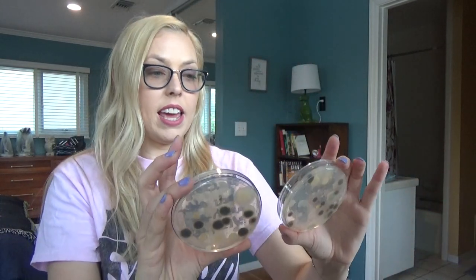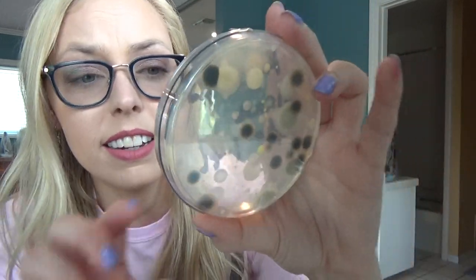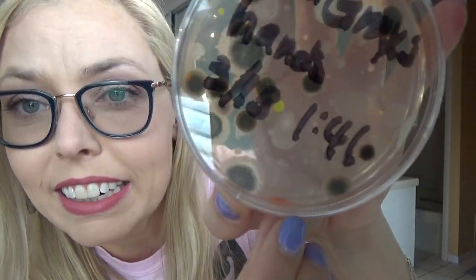Let's look at my hands before and after sanitizer — I don't even know what to make of this. Here's before sanitizer. Not that surprising — not too different from underneath Dani's hands. There's a lot on here: a lot of yellow, some orange down there, more yellow. It's like a rainbow — a very, very gross rainbow.